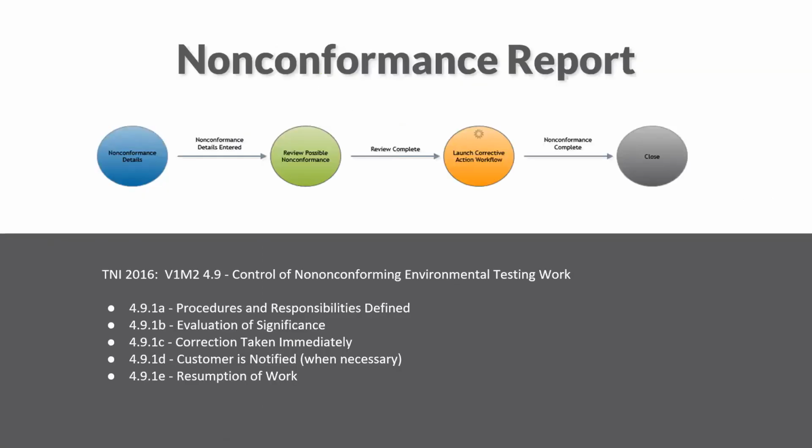All right, so the first one we're going to talk about is this non-conformance one. So it's a basic non-conformance report, allows anybody to report a potential issue. You'll see the flow of it up there at the top. The workflow process goes from step to step, so shape to shape in this image. And the routes, those arrows, connect each together. So at a step, we have somebody who needs to do something, and then we pass it on to somebody else who completes that next portion. And you'll see this in a Qualtrax system here in a second. So if you don't quite follow it yet, that's totally normal and fine.